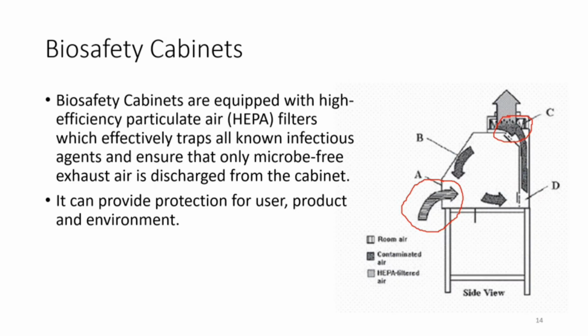BSC provides user protection because the contaminated air inside is not being directed back to the user. It also offers protection to the environment because the air being released is actually being filtered, so whatever infectious agents are present are being retained.